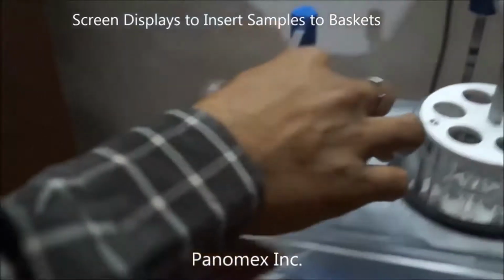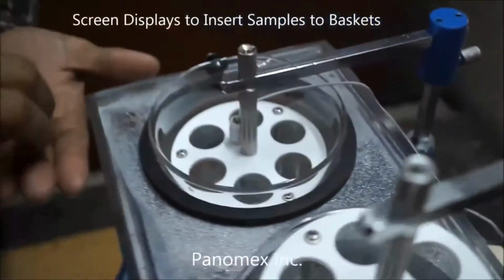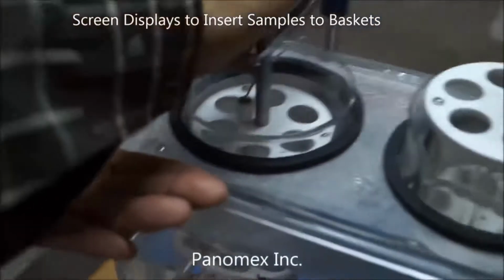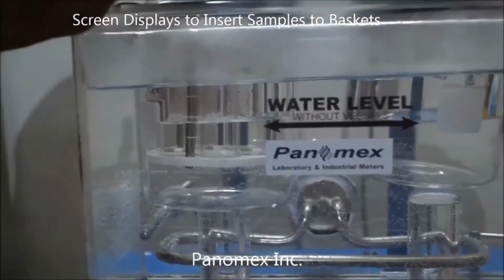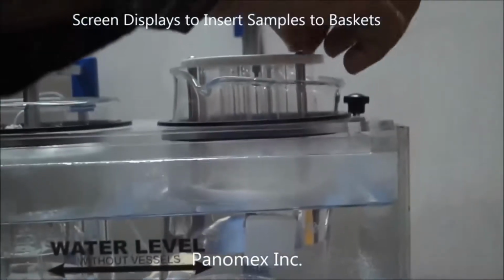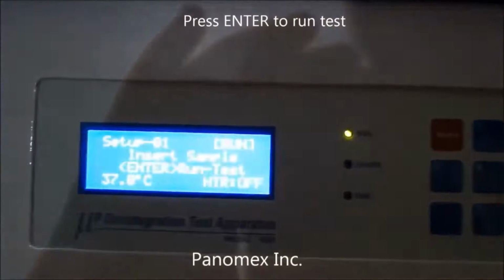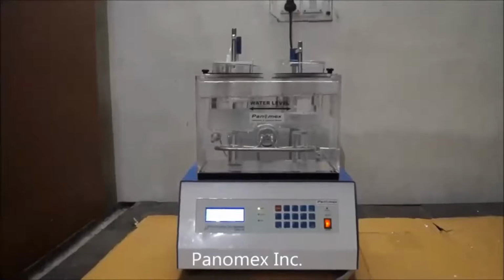So now we have to put the tablets. Now we have to wait for whatever time we have fixed.